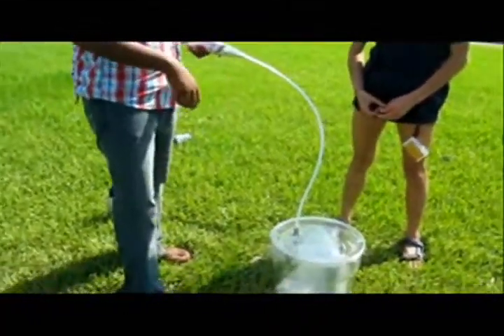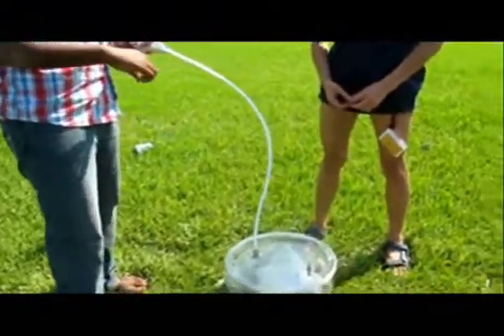So the air is going in, and as soon as we get the bag, we're going to seal it off.